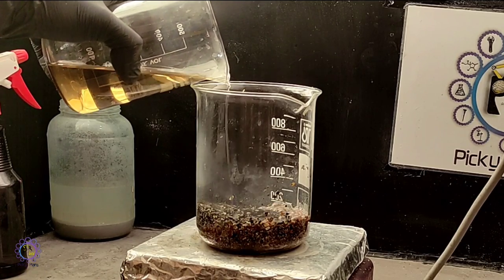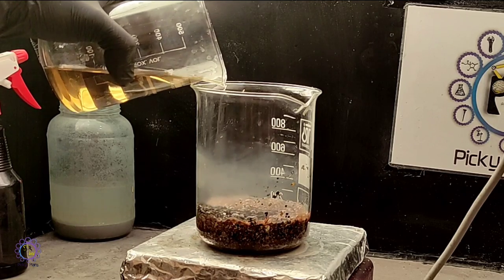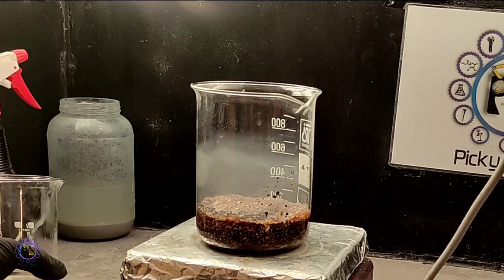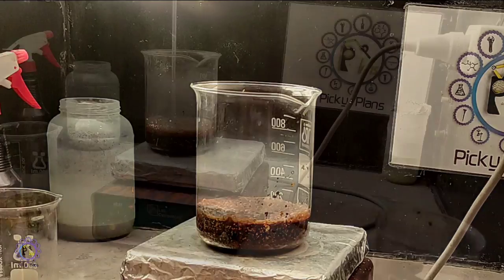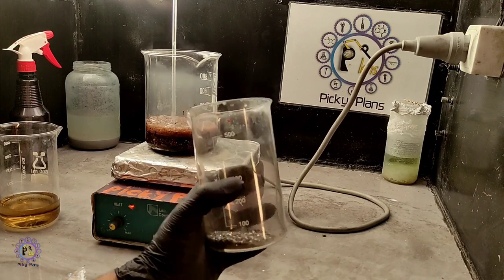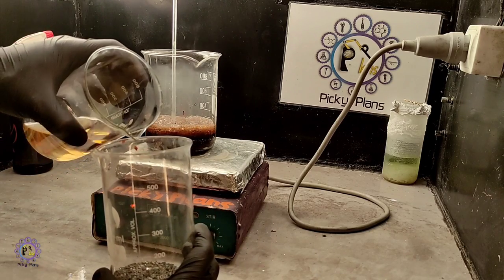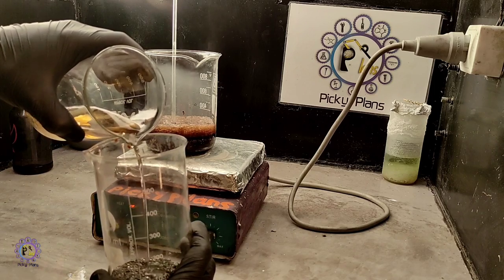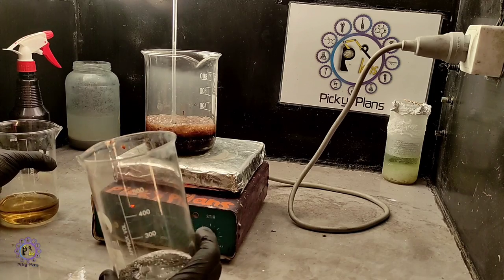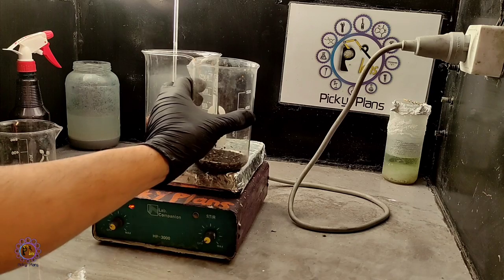To start dissolving any plastics which is present inside. Also, I want to process this magnetic material which has been separated with a weak magnet to see what we got finally from this material. I add sulfuric acid and place it on a hot plate.